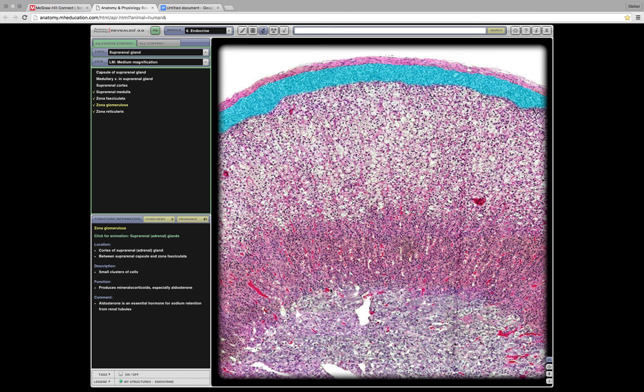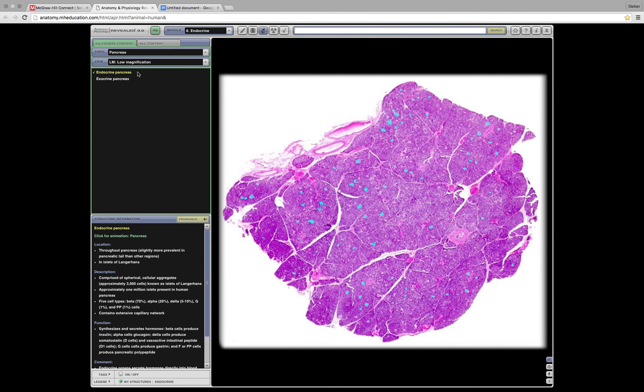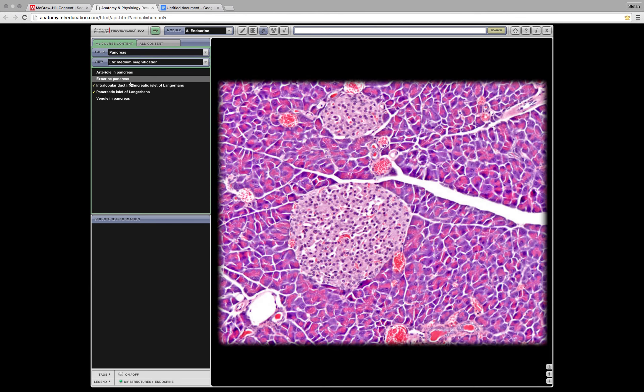So that was the adrenal gland. What's next? The pancreas. Pancreas. Select view, low. That's good enough. It's going to show you the endocrine and exocrine functions because the pancreas does both. Can we go even higher? Okay. This might not look like this on your exam, it might, I'm not sure. I haven't had it yet.